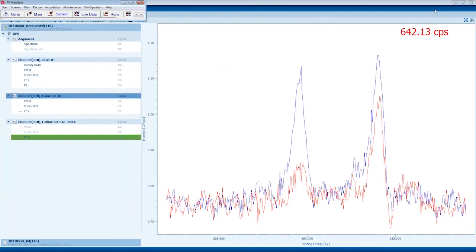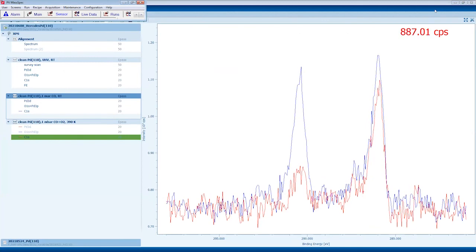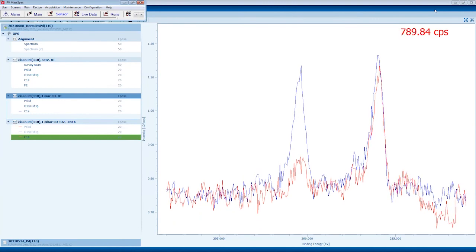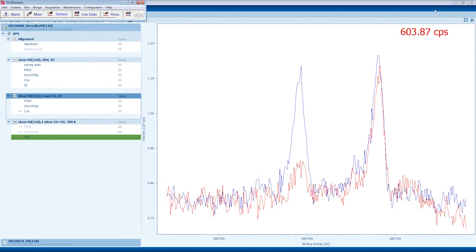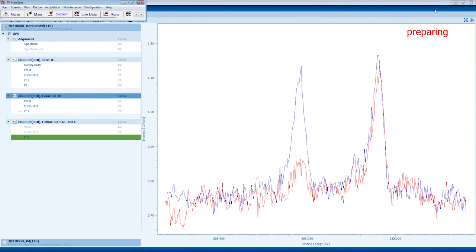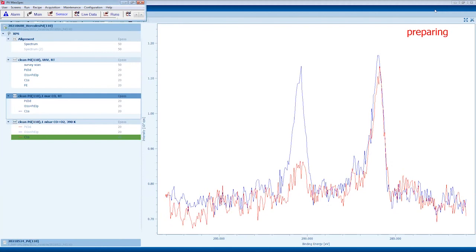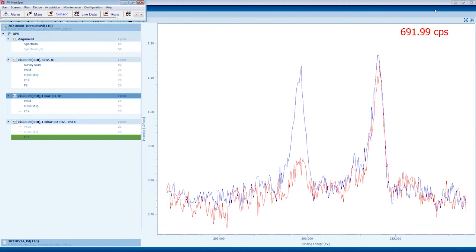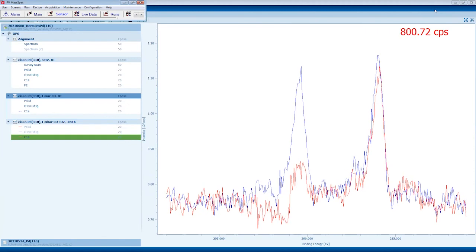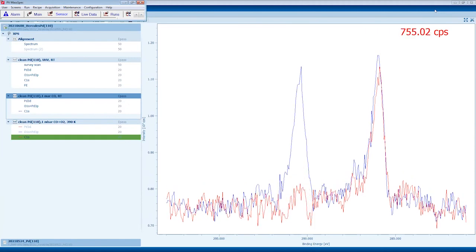Different kinds of samples can be measured here, from single crystals to powder. We can prepare some samples in situ using evaporators that can be filled with palladium, platinum, cerium, gold, iron, whatever. All this can be prepared under very well-defined ultra-high vacuum conditions. And well, we hope you enjoyed this session a little bit. We didn't bore you too much, and yeah, you had a good time.